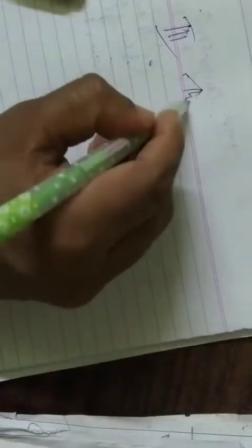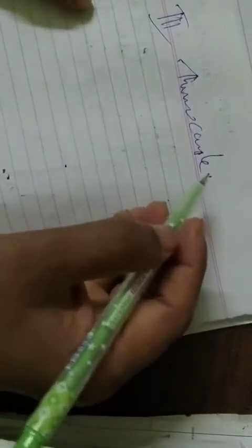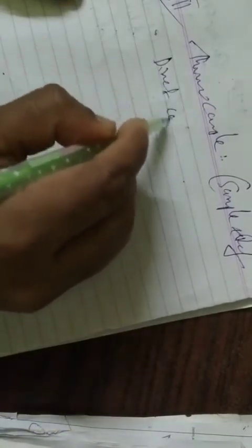Next is the thermocouple. The sample and the reference, whatever we are taking in containers, should be in direct contact with the thermocouple. This is important.